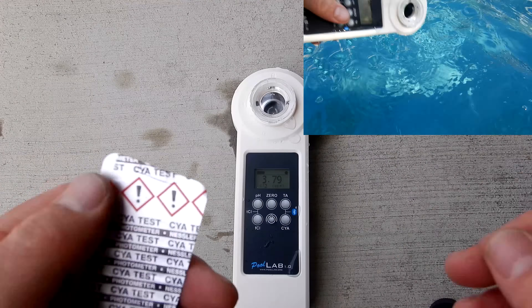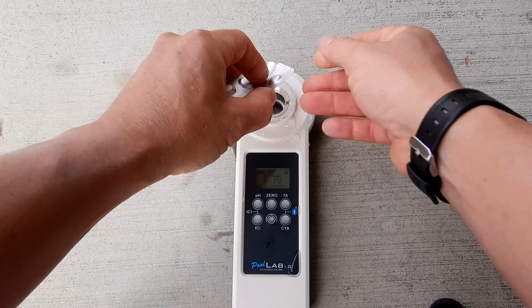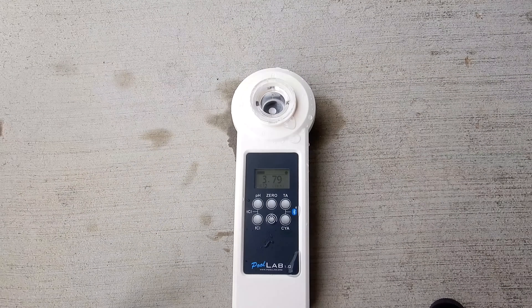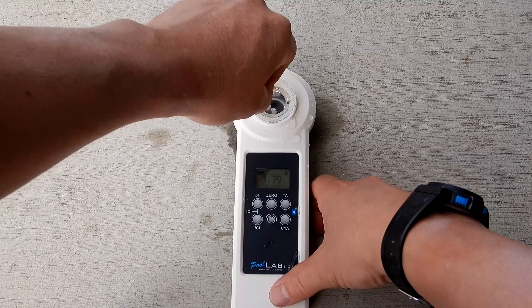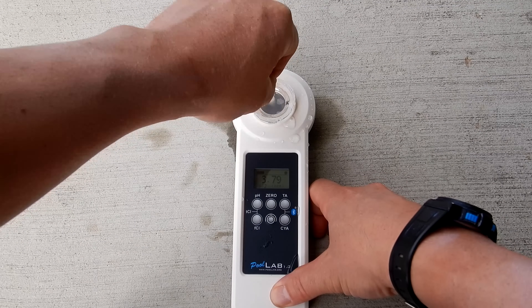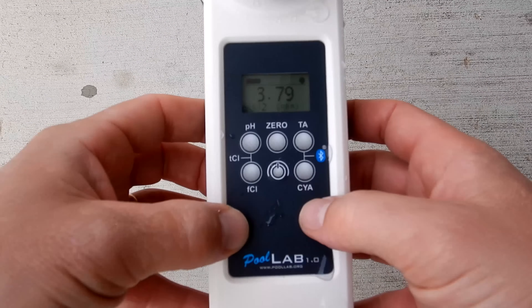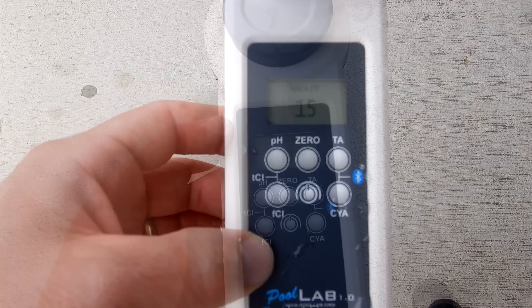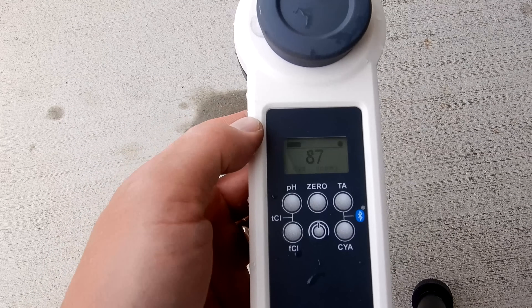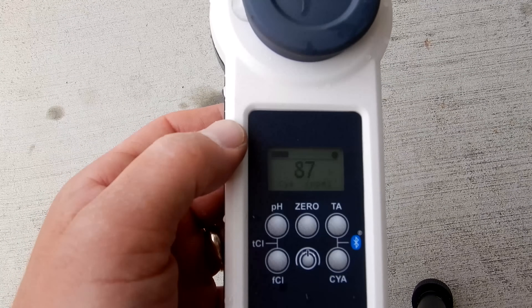The last test that comes in the kit is the cyanuric acid test. It'll test up to 160 parts per million. We're going to drop it in and break it up. These are the test factors that come when you order the unit. Let me go ahead and cover this up and push the CYA button. The CYA here is coming in at 87 — so it's a little bit on the high side, but it's acceptable.